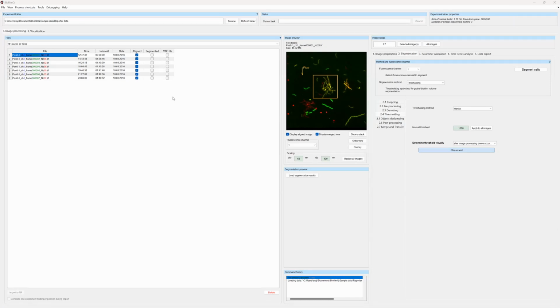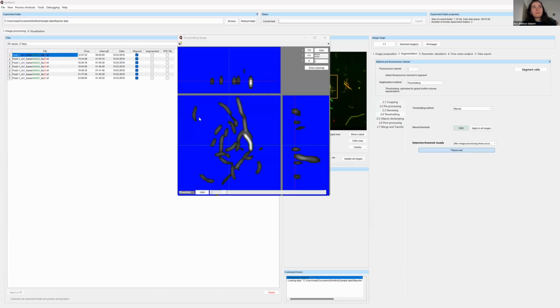Eva, at least I'm not seeing anything. The window, you're seeing it? No. Okay, I don't know if I'm the only one, but yeah. No. Thanks. Now, yes. Yeah. Thanks. Okay. Sorry about that. Then you probably also didn't see the Z stack, right?